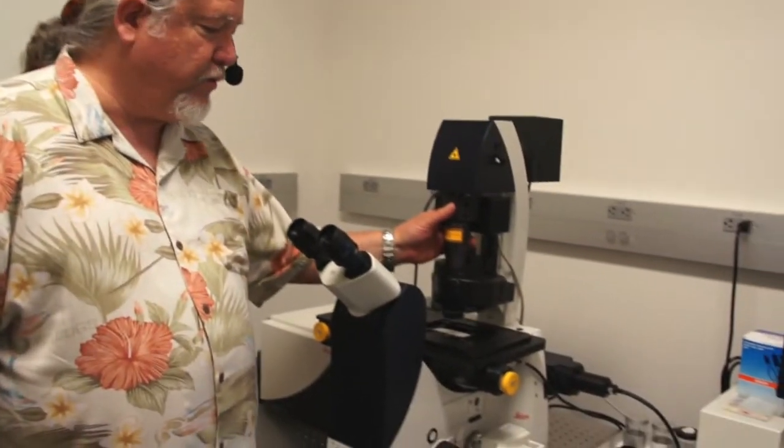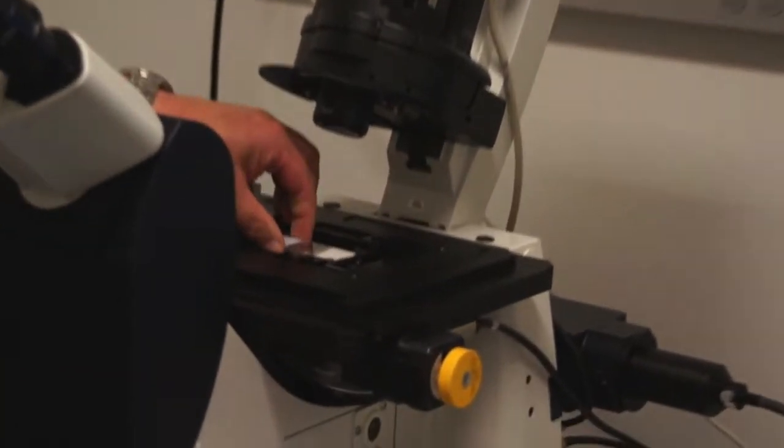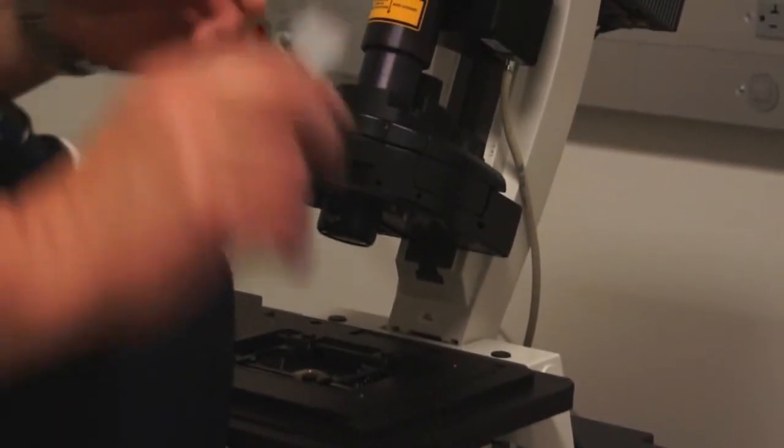Before we end our current session, it's important to follow proper shutdown procedures for using the light microscope. The first thing we do is we rotate our condenser out of the way. We take our specimen off the stage and set it aside.